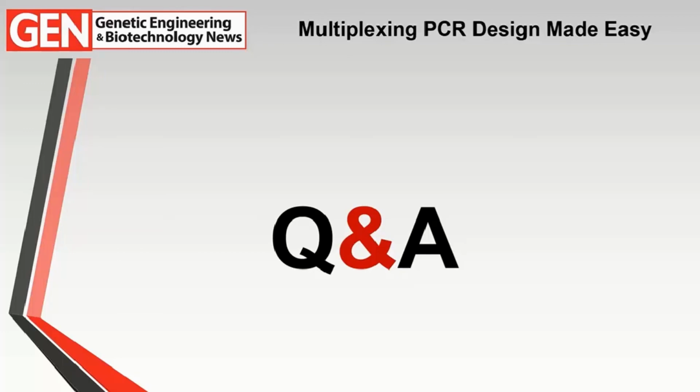If you go for the larger panels, as John mentioned, preamp for sequencing and everything, obviously this number can go extremely large. So it depends really on what you want to do. If you want to do a quantitative analysis or you're using it as a preamp, you need just a 10-fold increase from the background to do the sequencing. Those numbers can then be extremely large.